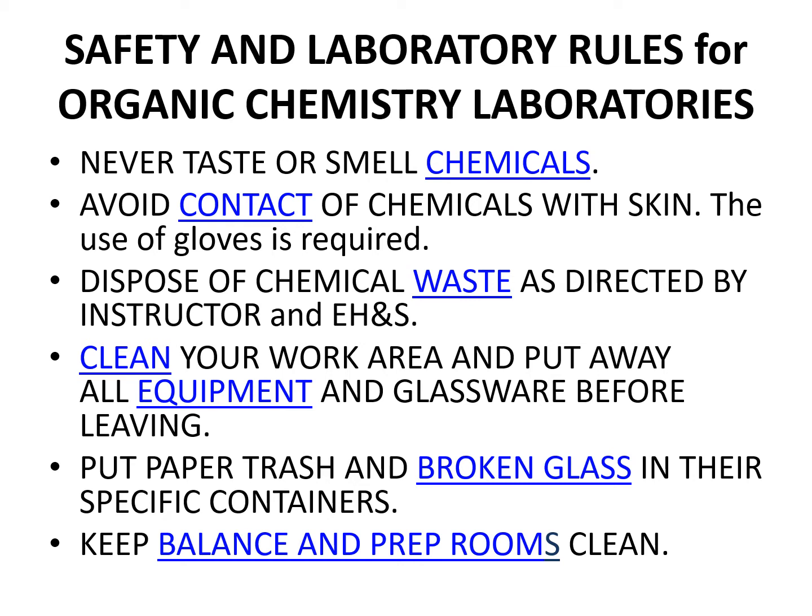And of course, avoid contact of chemicals with skin. Most of the stuff we're going to use is either corrosive or at best a skin irritant, so try not to get anything on you. You're going to be wearing gloves and a lab coat, so that's generally not a problem. Any chemical waste, when you're done, needs to be disposed of correctly. It's going to be directed by your instructor, TA, and environmental health and safety. We'll talk about that a little bit later.